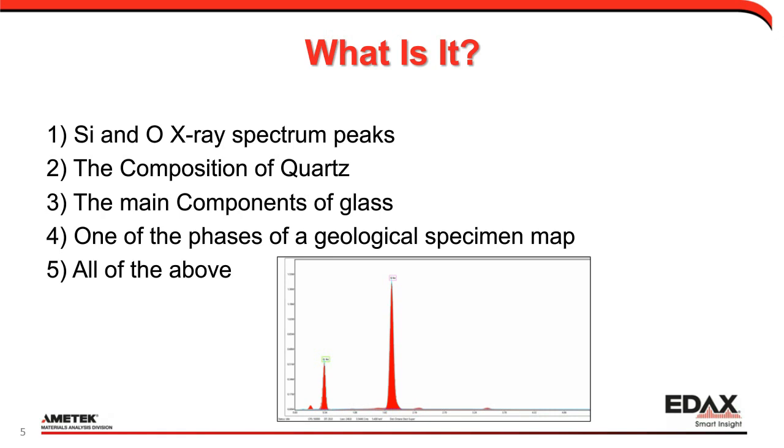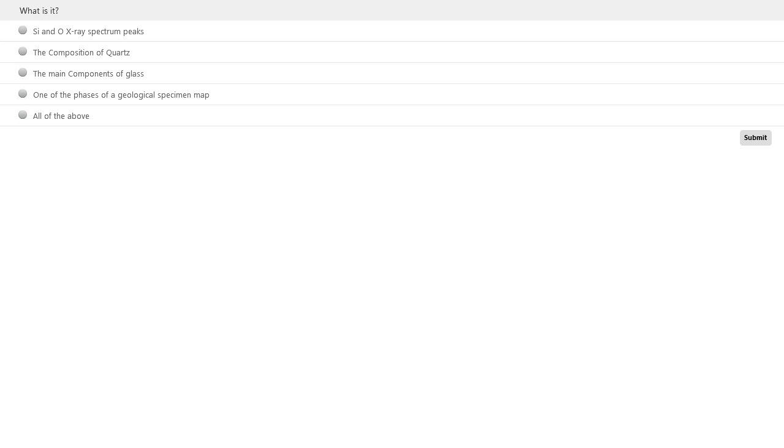And there are many different ways of answering this question. You might even say, well, that is the piece of contaminant that I found on my microelectronic circuit, something that doesn't belong there. If you're a failure analyst, you might say this is the spectrum that I got from the thing that doesn't belong there.